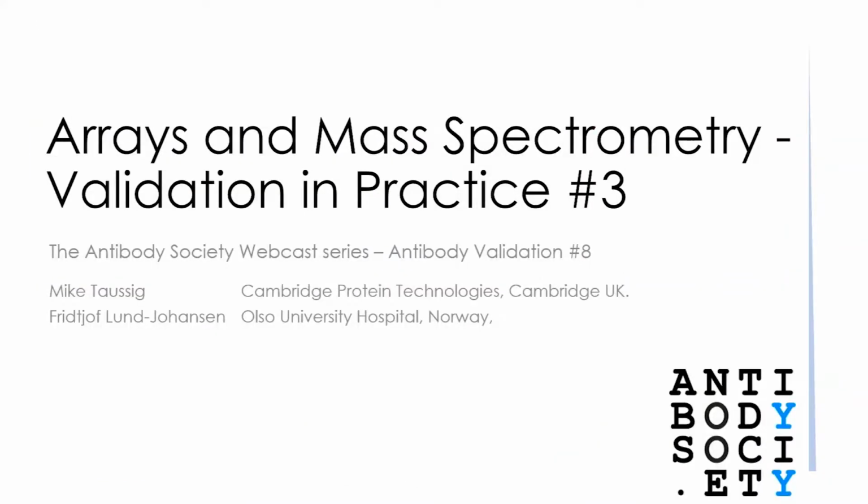So as long as it's possible to get the protein into solution in a non-aggregated form, the technology is applicable to pretty much any target. But aren't there a number of issues in comparing quantifications derived from mass spectrometry measurements, or is that just old hat these days? I think that mass spectrometry, as we use it, this is label-free mass spectrometry, is semi-quantitative, and it probably is just as good as fluorescence analysis.